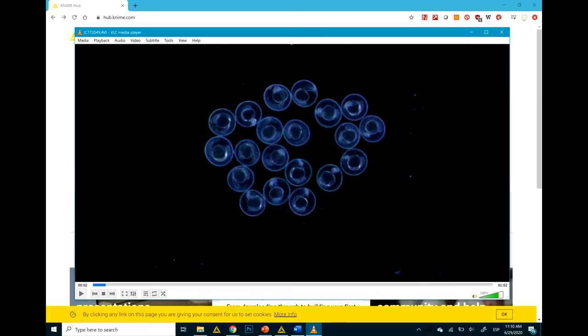Hello, my name is Elizabeth and this is a tutorial on how to use the KNIME workflow for measuring spontaneous tail coilings in the zebrafish. Here you have an example video that we will be analyzing, which shows the spontaneous tail coilings in the zebrafish.